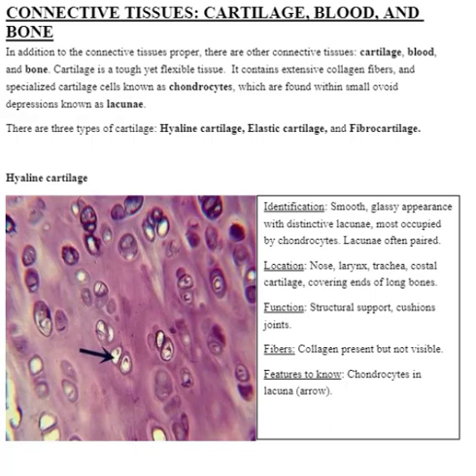As with all of the dense and irregular connective tissue and the cartilage, you're going to have collagen. That's just one of the constituents that makes it up. But in the case of hyaline cartilage, you have so little that you actually don't see those big ropey fibers.